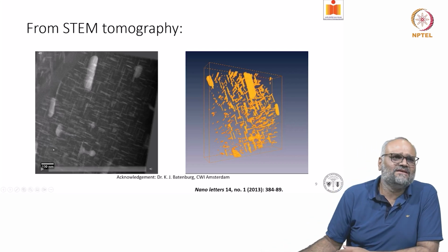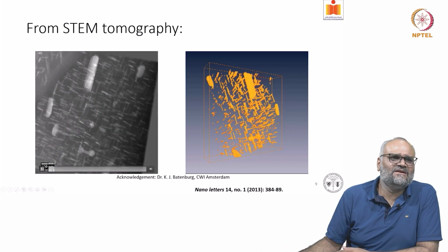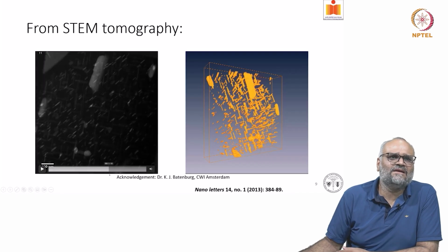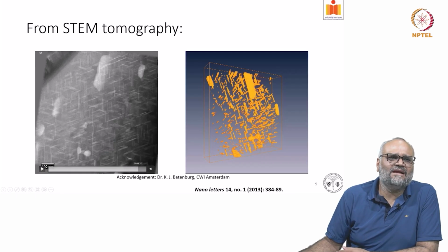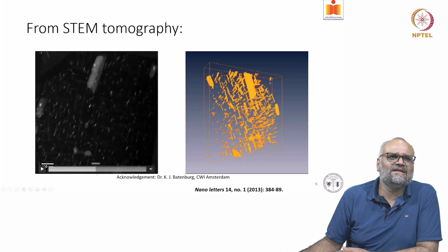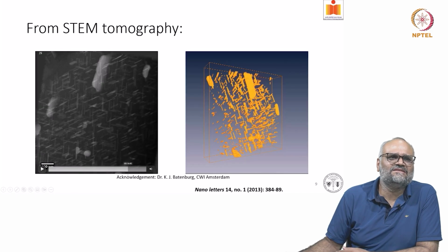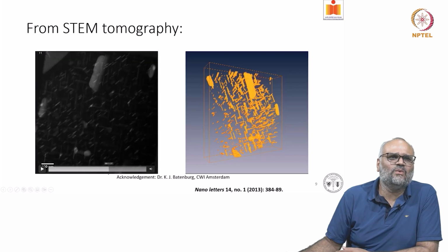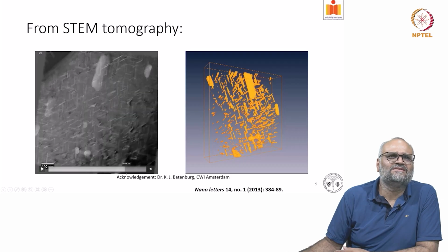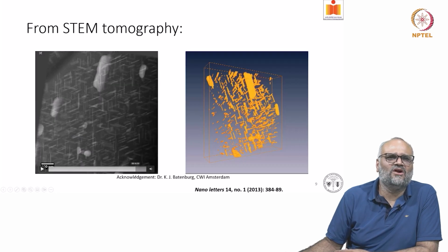You orient the specimen at different angles, and while you're tilting, you're simultaneously acquiring STEM images.